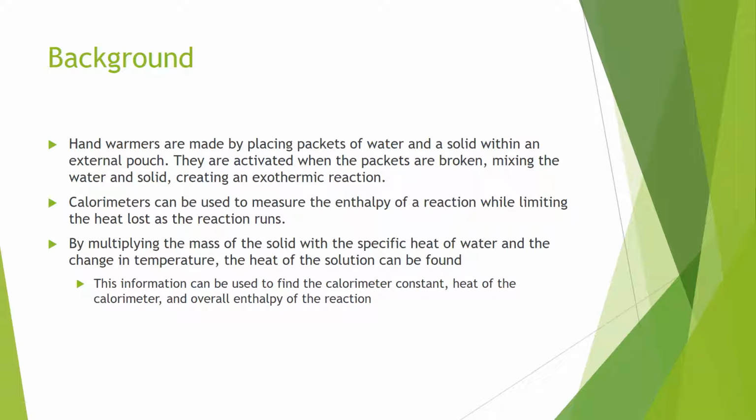Hand warmers are made by placing packets of water and a solid within an external pouch. They are activated when the packets are broken, mixing the water and solid, creating an exothermic reaction. The greater the exothermic reaction, the more heat produced, and therefore the more effective the hand warmer.